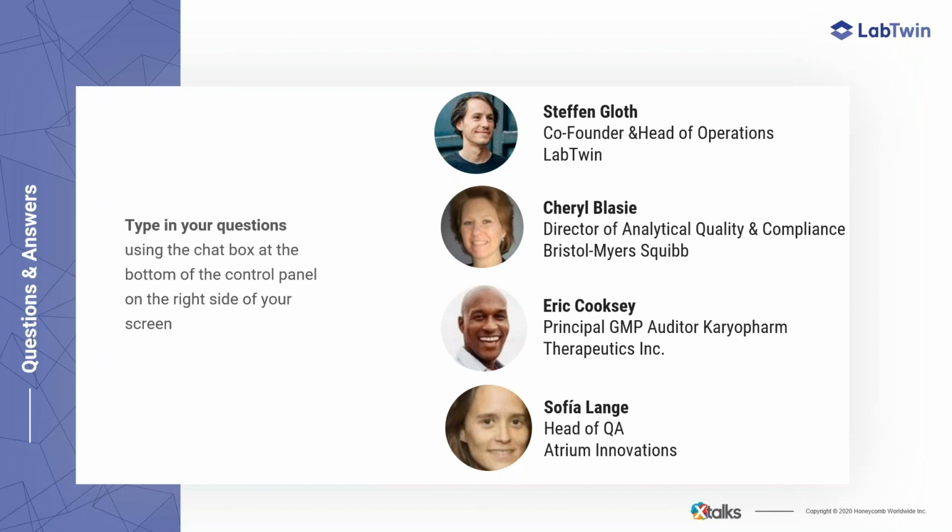So, and again, the contemporaneous part, I think there was another question in the chat box about what that means. The intent of contemporaneous is that a step is performed and the data is recorded at the same time, or within a second or two of each other, whatever's appropriate for the particular manipulation. So yeah, it's a challenge to make sure that all your documents are in a row. And again, enablers to getting contemporaneous records has always been a big focus of health authorities.